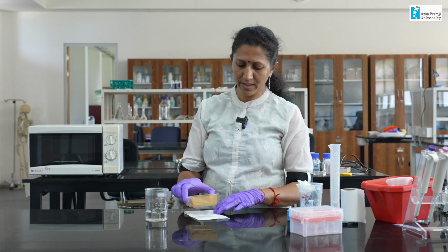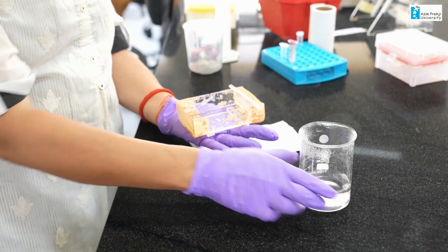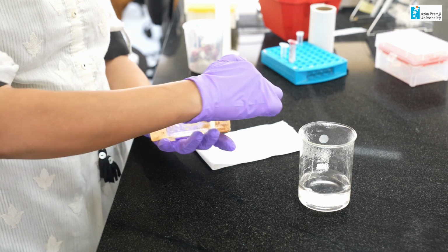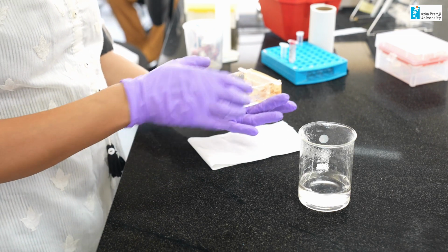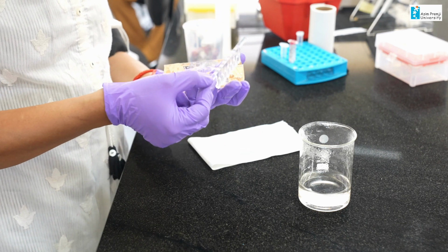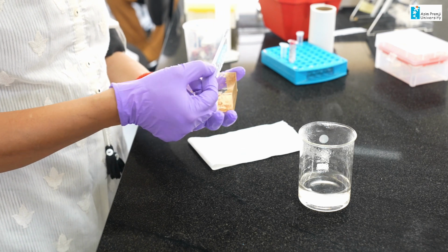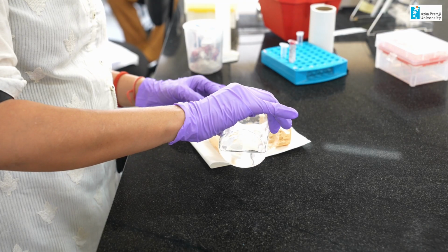And pour into a gel casting tray. So, this is a gel casting tray. I taped it on both the ends so that when I pour the gel it will not leak and come out. And there is a comb here which will make the wells when you pour the gel. Pour the melted agarose into it.